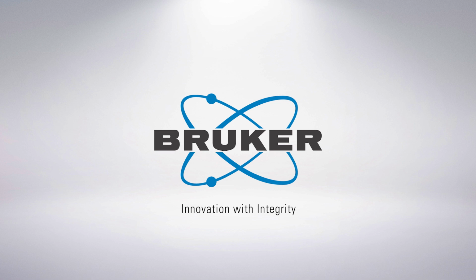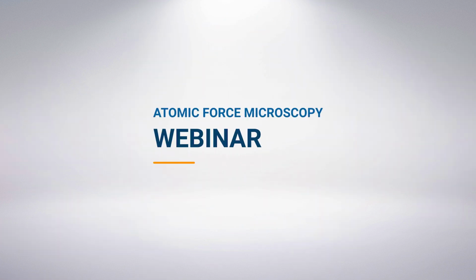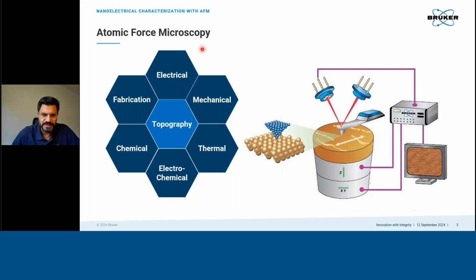So, as you can see on this slide, almost 40 years ago AFM was invented basically to look into the surface topography. But nowadays, it has evolved tremendously so that we can actually look into the characterization of many properties of samples and materials at the nanoscale, including electrical, mechanical, thermal, electrochemical, and even chemical characterization. And sometimes we can also use the AFM probe for nanofabrication.